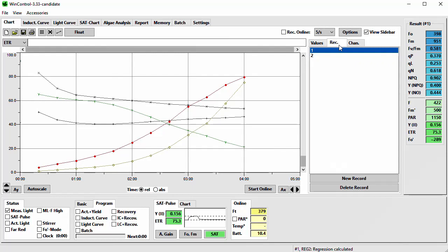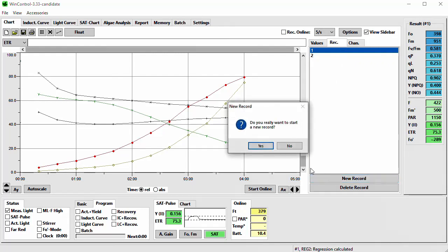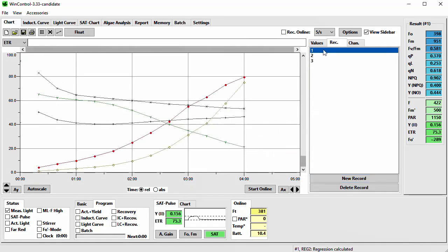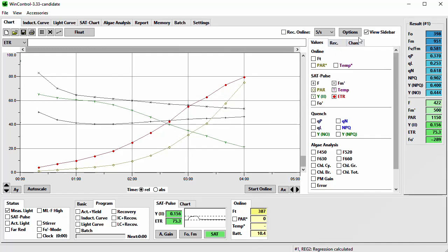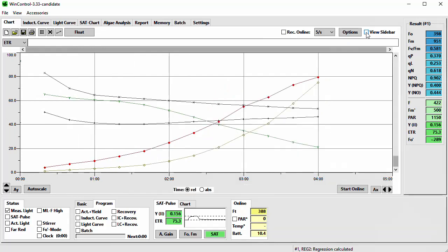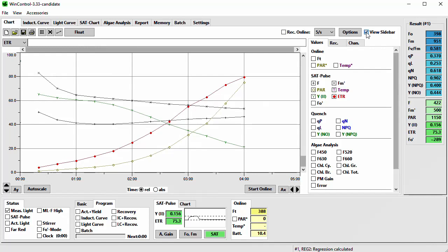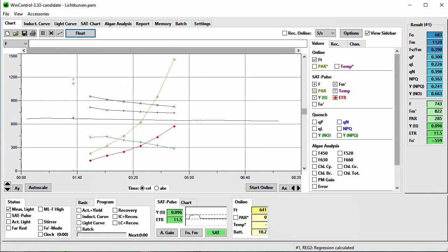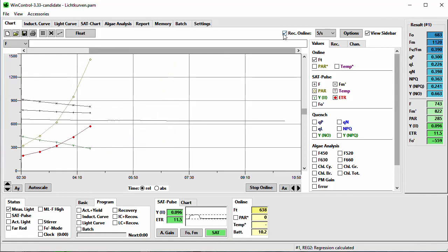In Record you can organize your data structure — there is a button to open a new record, or you can scroll through older records in the same file. If you are working with a computer having a small display, you can hide the complete sidebar by unchecking the View Sidebar checkbox. The chart tab is for all kinds of experiments, and all measured data can be displayed graphically. There is also another function: you can start online chart recordings. If you press the button or activate the checkbox, the software will record all online parameters continuously and store them as a separate chart file. You can decide to record five data sets per second, one data set per second, or one data set every 10 seconds.